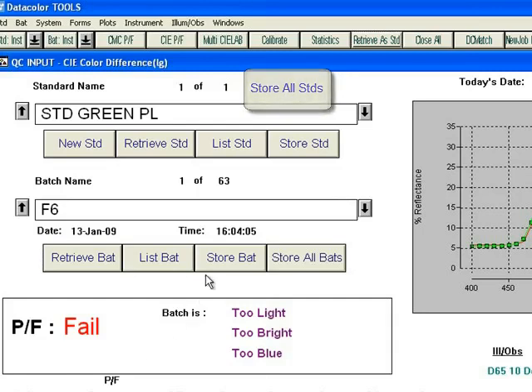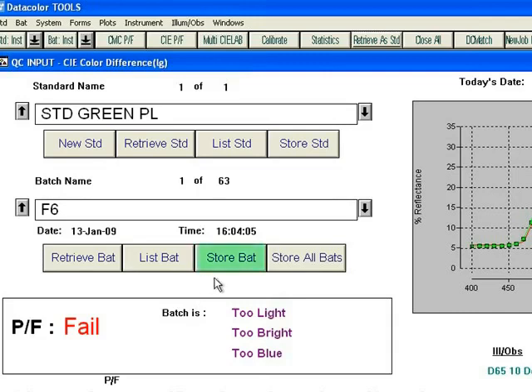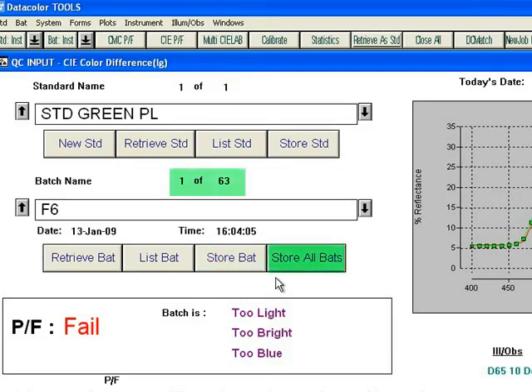We will now store batches. Notice under Batch you have two buttons for storing batches. StoreBat will store the current batch, and StoreAllBat will store all 63 batches on your desktop.